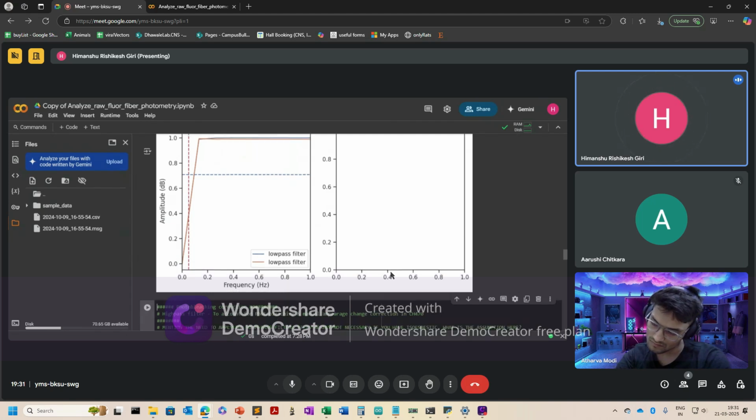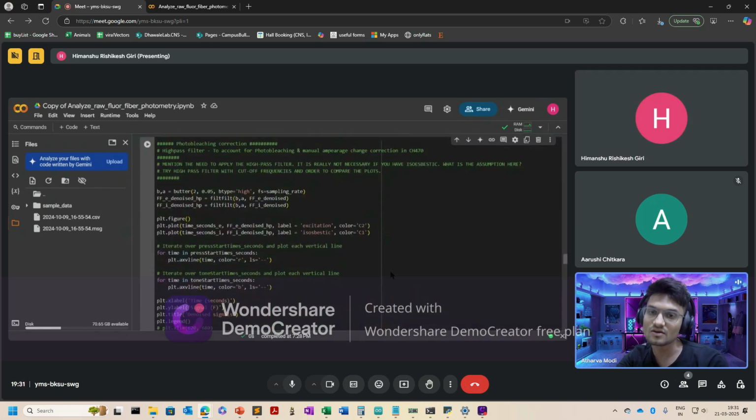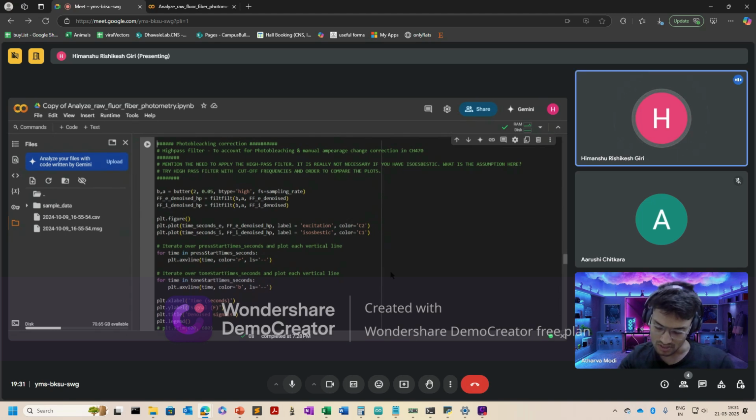And also we'll see now in the next cell. Okay, so let's proceed. The scale that we use is df over f, right? So that f itself will incorporate all tonic level changes, and you will not get that out of df over f. So yes, we need some other analysis methods for this.